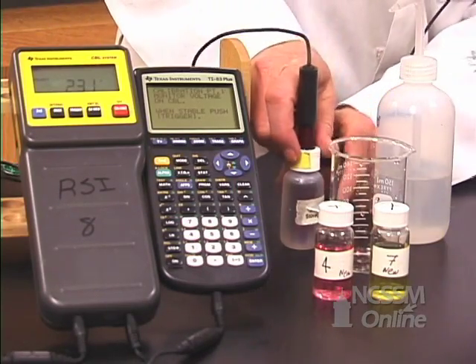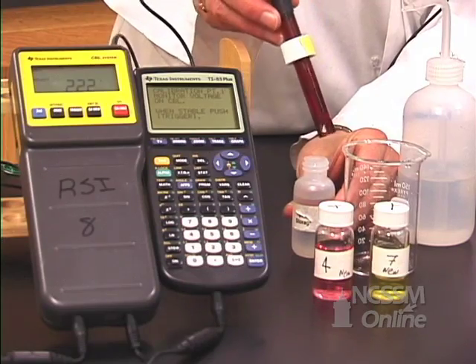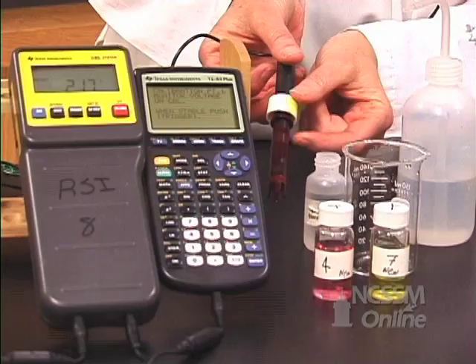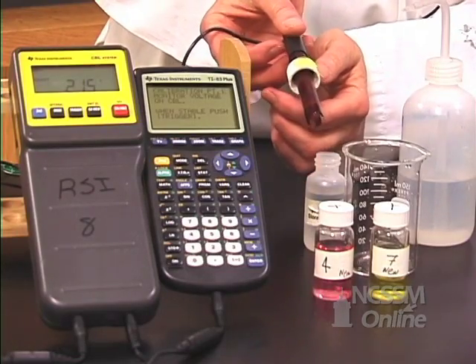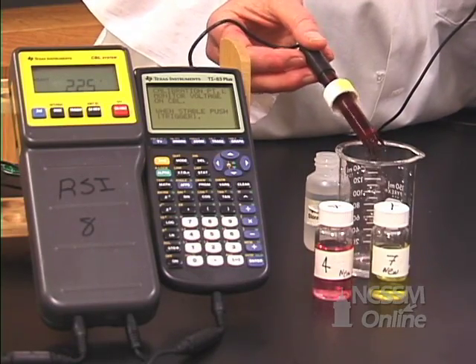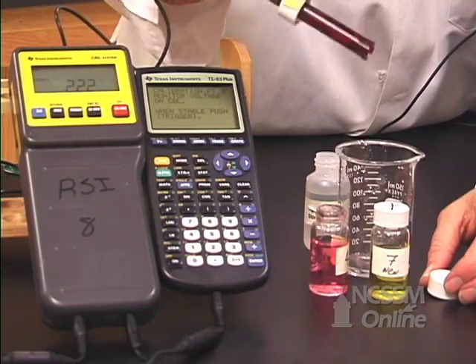Next, take the pH probe from its storage bottle. These are stored in a solution to protect the probe — the sensitive part is right on the very tip. Leave the cap with the O-ring attached; if it's in the way, just push it up a little bit, but leave it on because we'll return the probe to the bottle. The first thing you do after taking it out is rinse it — make sure you get the solution off. You don't have to dry it; that drop of water is fine.